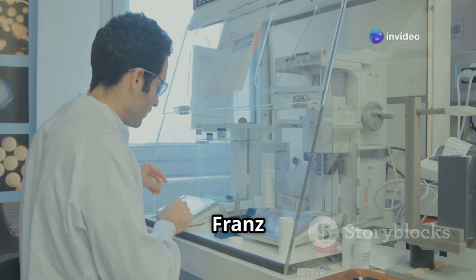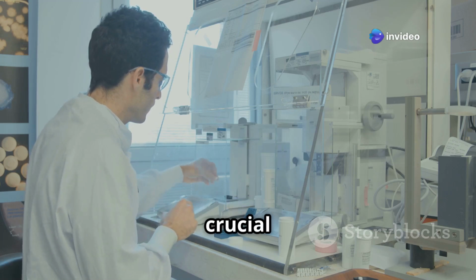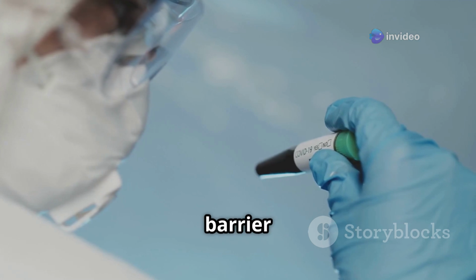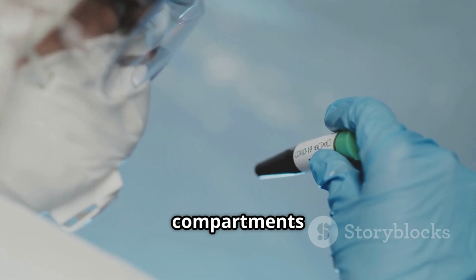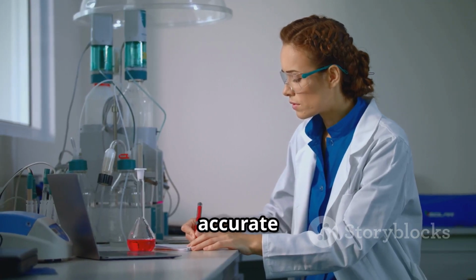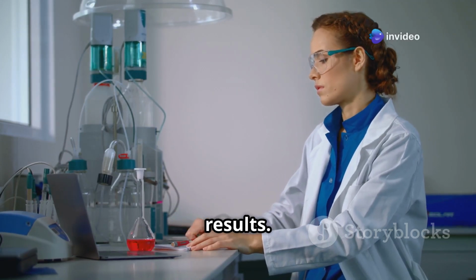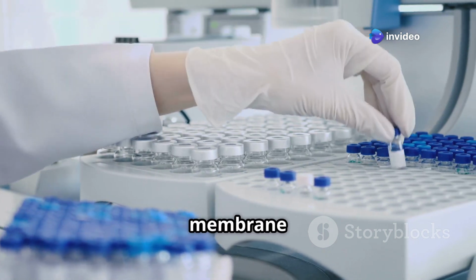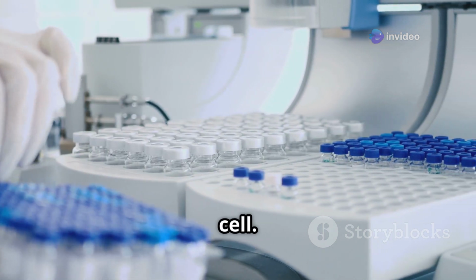Mounting a membrane on a Franz diffusion cell is a delicate but crucial step in IVRT. Proper membrane mounting ensures that the barrier between the donor and receptor compartments is uniform and without leaks. This is essential for obtaining accurate and reliable results. The process begins by carefully placing the chosen membrane between the two halves of the Franz cell.